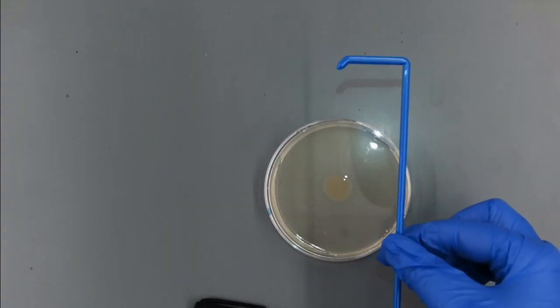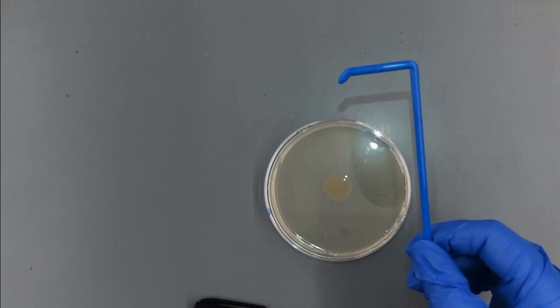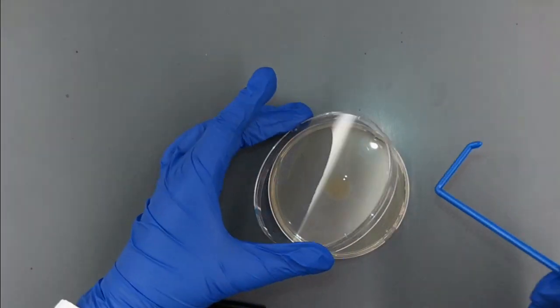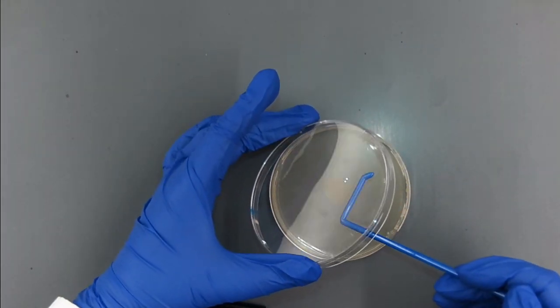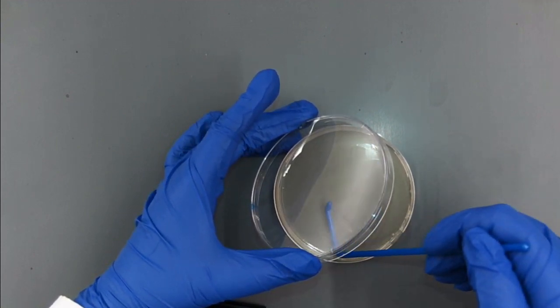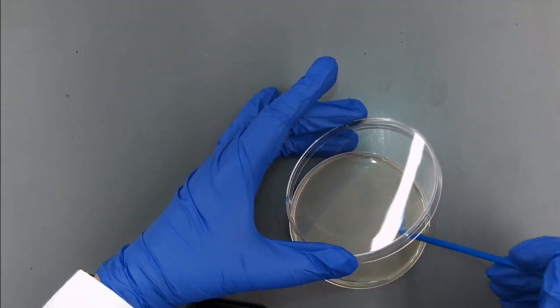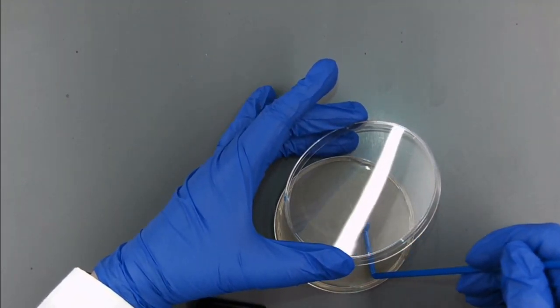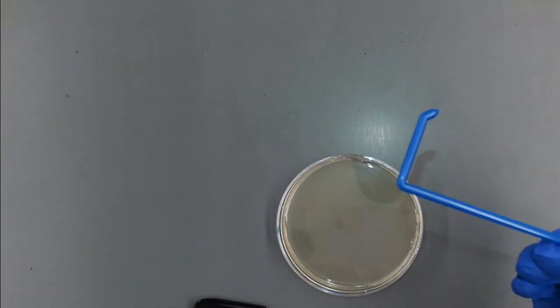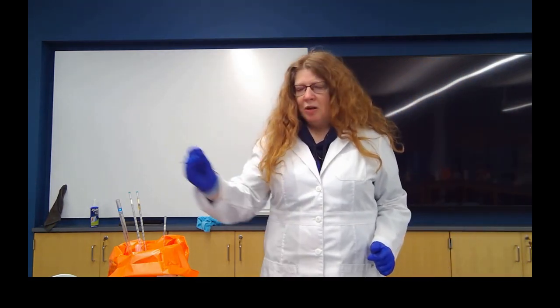Now, this is called a cell spreader. This one is sterile. They're often made of glass, but this one is disposable and plastic. So I'm going to take off the lid, using the lid as a shield, and I'm going to just spread the culture all around the plate using my cell spreader. This then goes into biohazard.